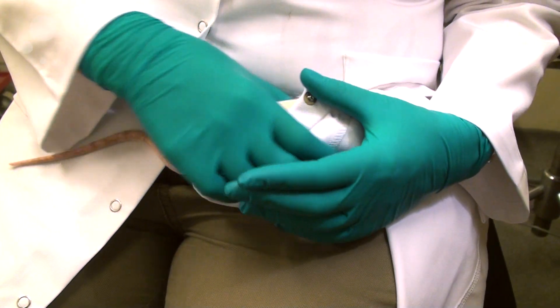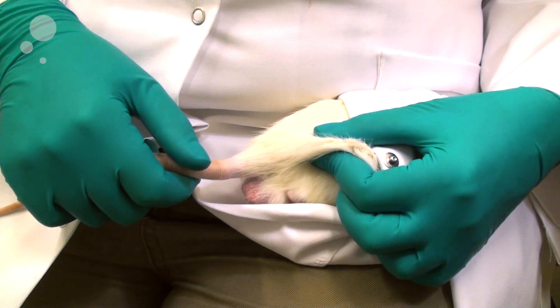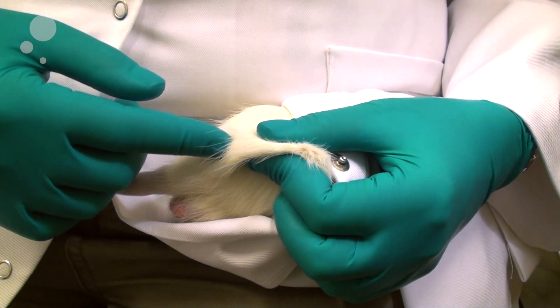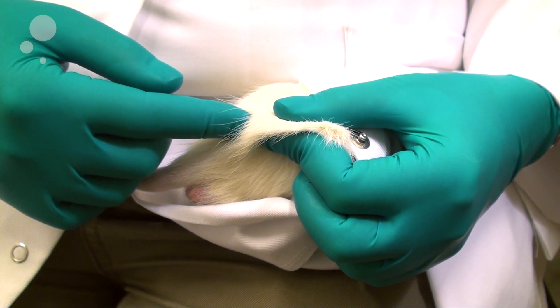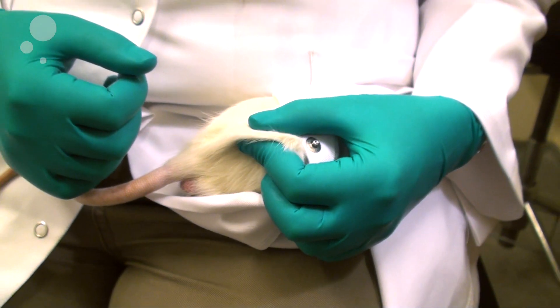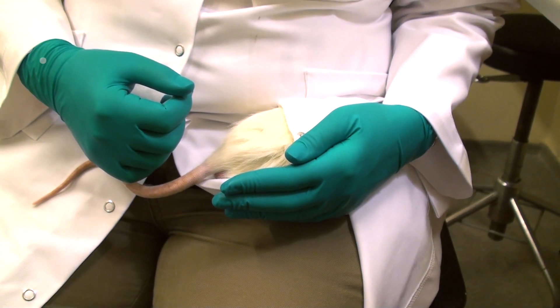With your left hand you support his body and you make a skin fold, and then you can use your right hand for injecting the substance that you're going to inject. He will be calmer when wrapped in the lab coat than if you just hold him.